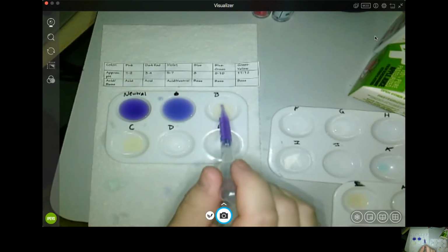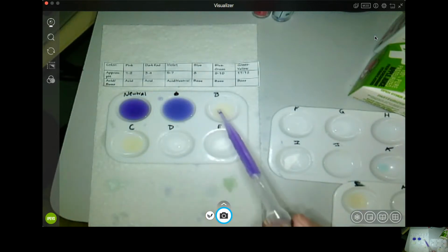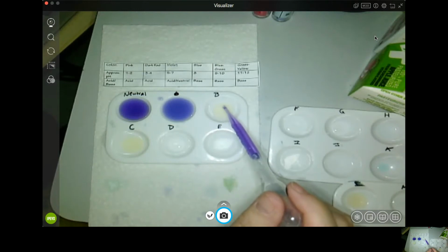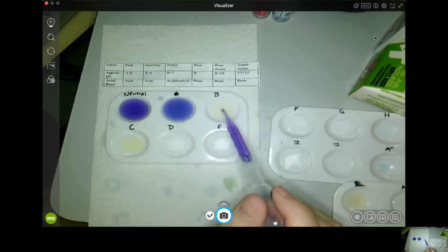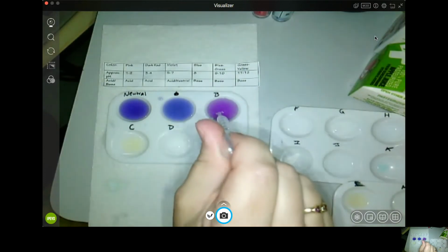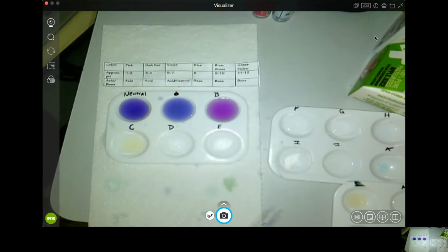Ready? This one is lemon juice. Lemon juice, acid or a base? What do you think? Acid. Strong or weak acid? Ever get it in a cut? Yeah. Give that a second, because that should turn a little bit more pink, I think. That definitely should.